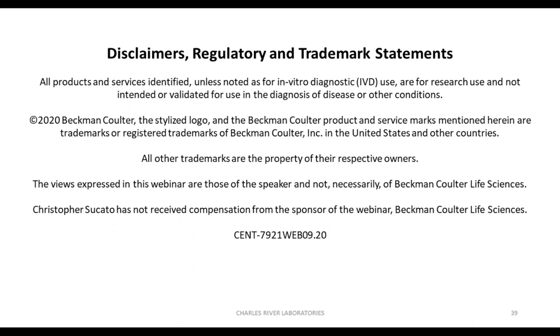The ability to lock methods, as well as data encryption, so encryption of the raw data, and proper storage or maybe even server-based filing of this information would be very worthwhile, I think.